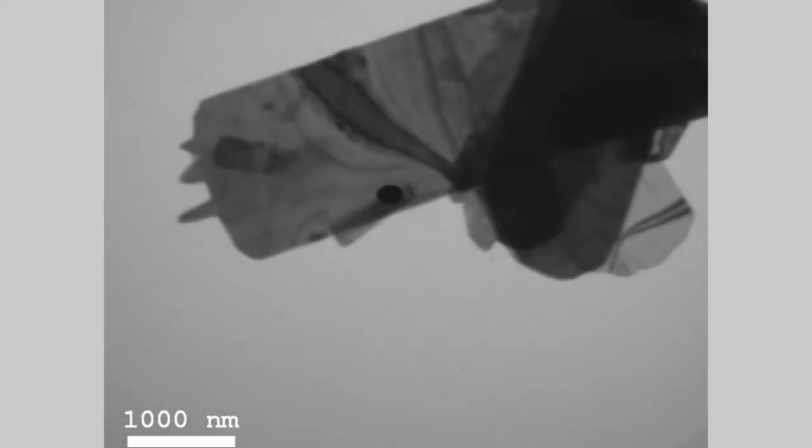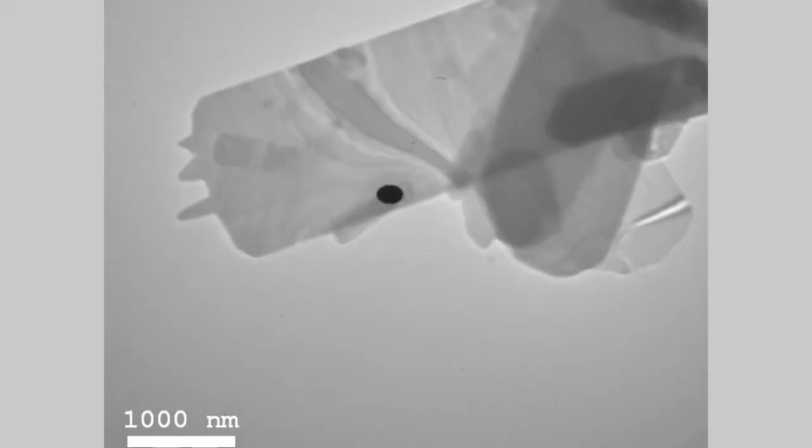The black things become more black. That means that the electrons that were deflected in the sample have now been filtered completely away, and they never hit the fluorescent screen. You can increase or you can reduce this effect by choosing different sizes of the aperture. And then we're back at the beginning.